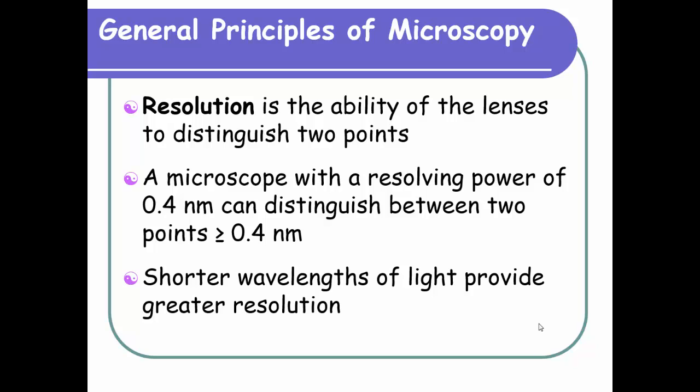On your microscopes, you have a blue filter. What the blue filter does is it filters out all of the light except for the blue or violet light waves coming in from the white light illumination source. Why would this be?